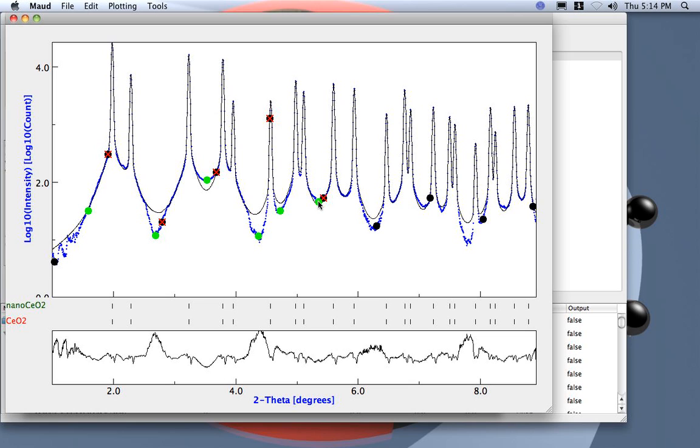Actually, it will not use only one point, but a certain range of points over here. This is okay. Let's put one over here and one over here. Leave this one. We put one here. We can also put a little bit more than what we need. Okay, what are we missing here and here?